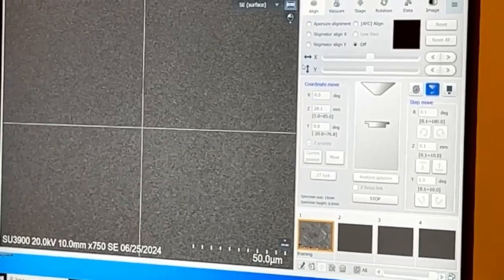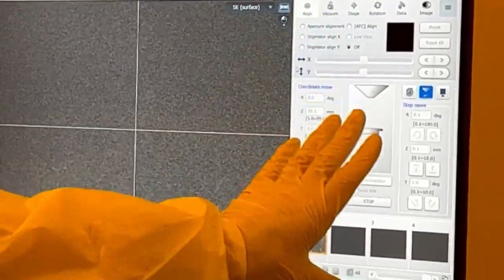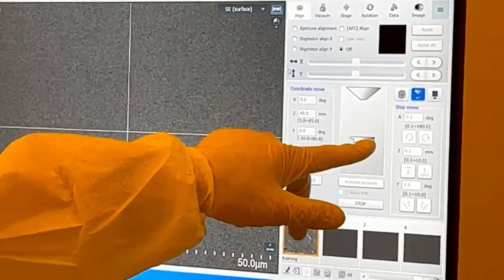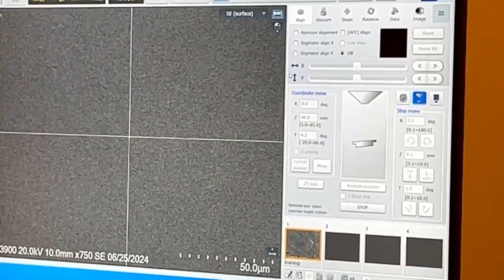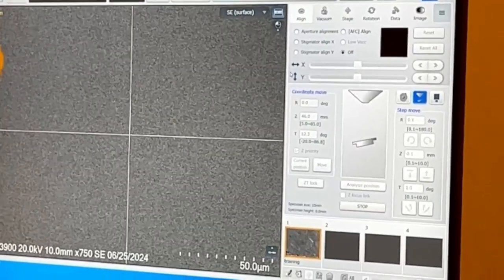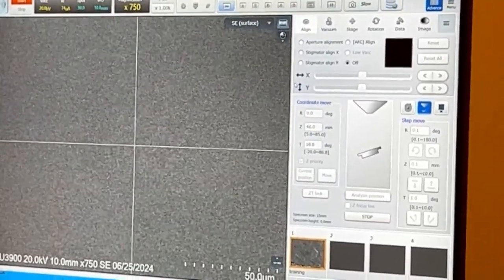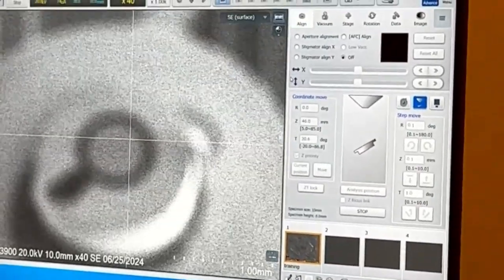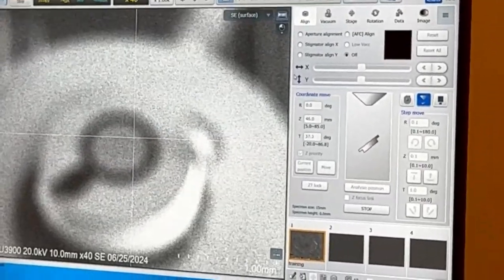Are you happy? So this is nice, so you can actually see a representation of what happened, and then this will change too, depending on how big a size we put in. So you can actually see it tilting in there.